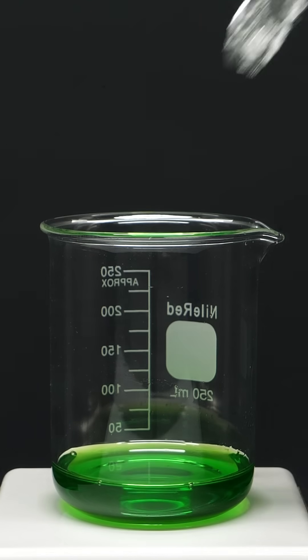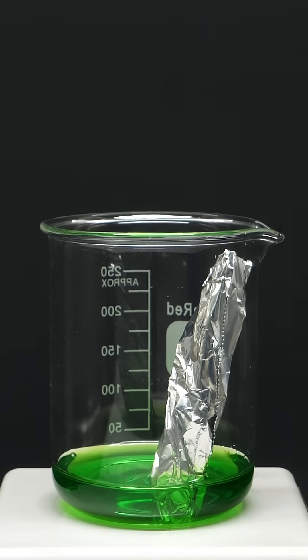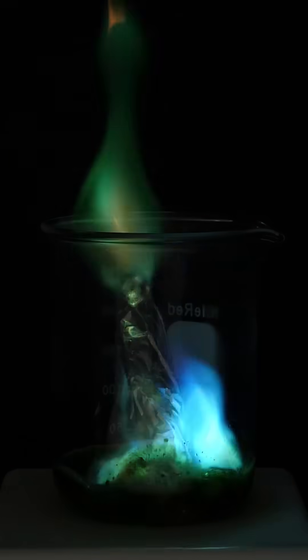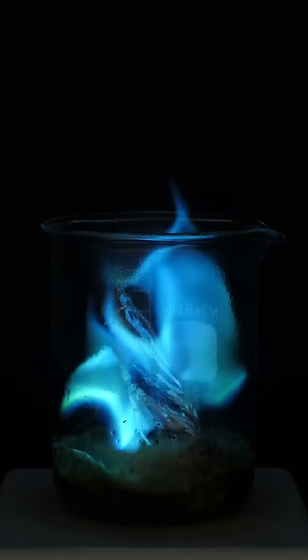I can also throw some aluminum into an acidic copper solution and get a blue flame.